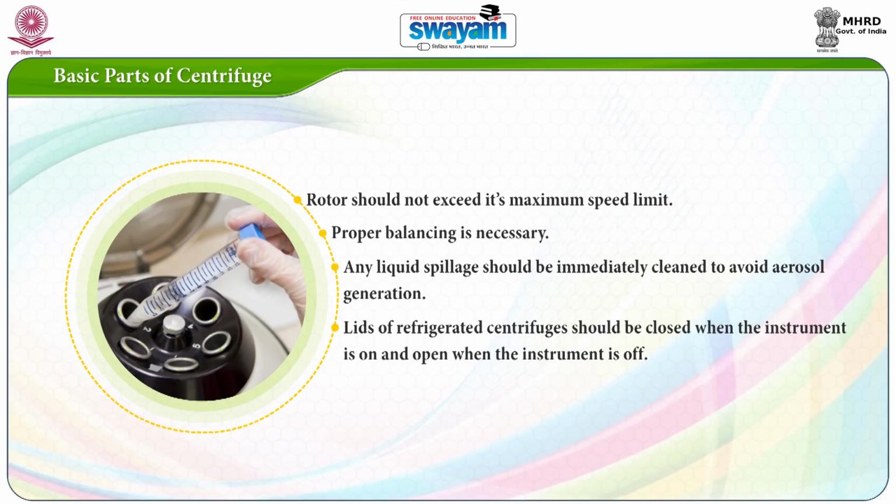So if you are centrifuging infectious particles, the aerosol generated will also contain infectious particles. So it is harmful to humans. That is why, to avoid or minimize the aerosol formation, we have to clean the centrifuge properly.